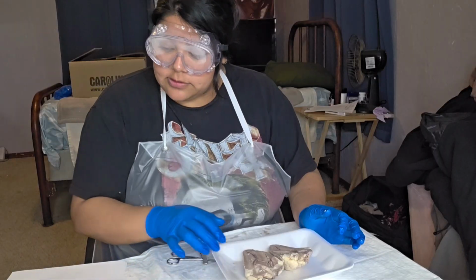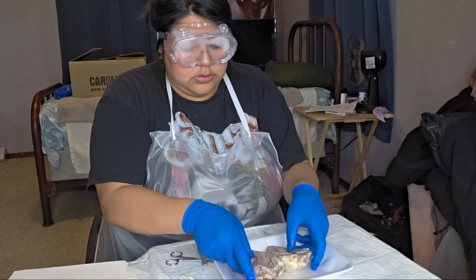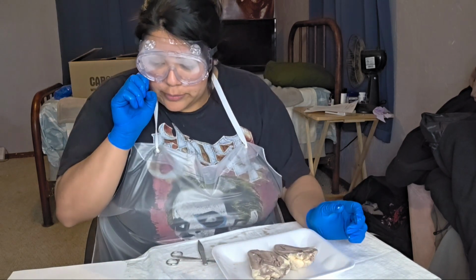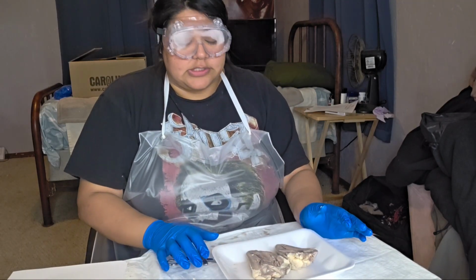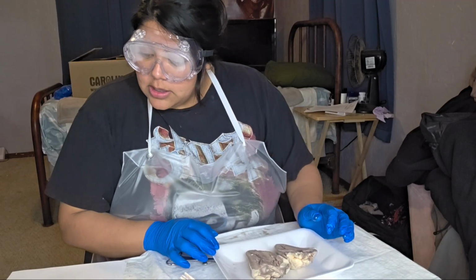Use your fingers to feel the thickness of the right ventricle versus the left. Very thick. Find the septum on the right side, which is going to be here. This is the piece that separates the two chambers.